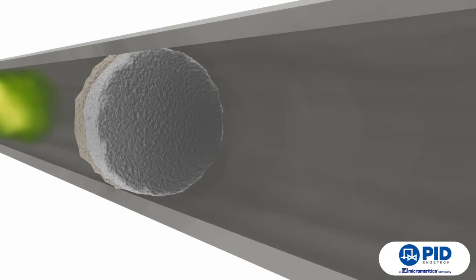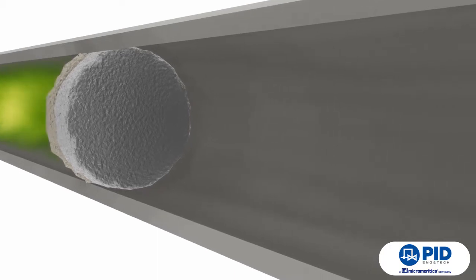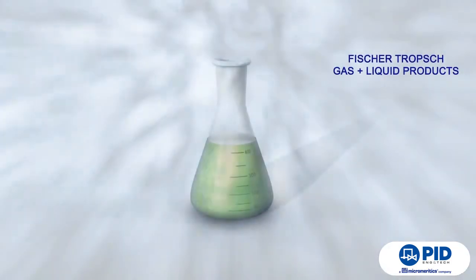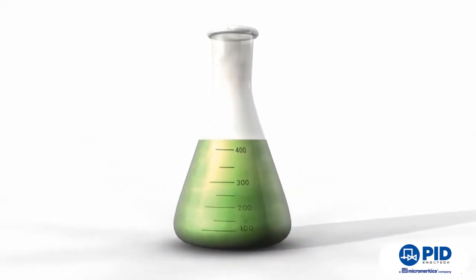However, there are many reactions like the Fischer-Tropsch synthesis, in which both gas and liquid products are obtained. In these cases, liquids are separated from gases in a condenser downstream the reactor.